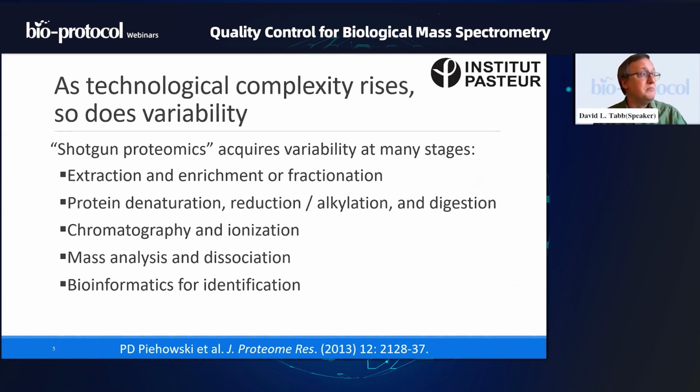So if you were building a car, there could be a problem with the gear shift. There could be a problem with the lubricants you place in the system. There may be problems with the door handle, right? I mean, the more complex an object, the more ways it can break, right? The same is true for processes. When we have a complex process that gives us our data, there are lots of opportunities for variability to enter that process and give us a variable outcome as a result.